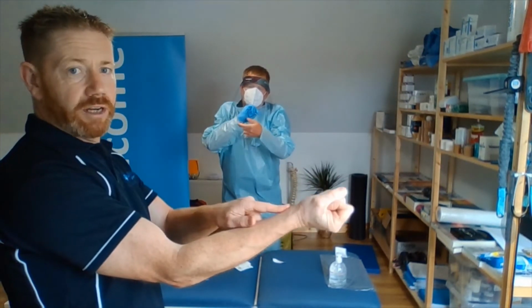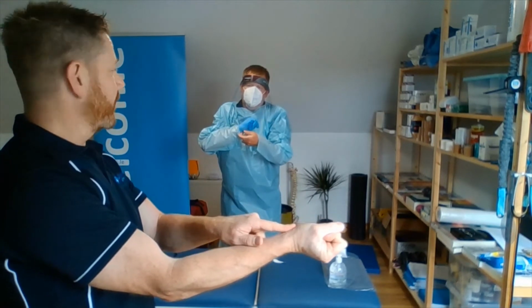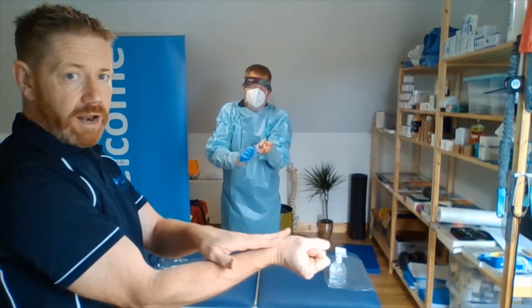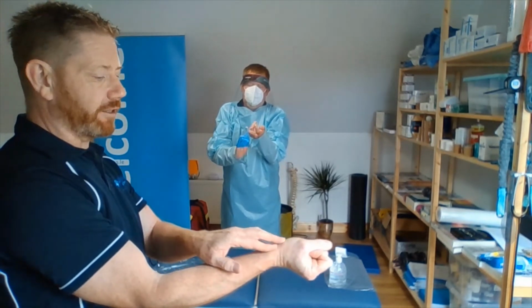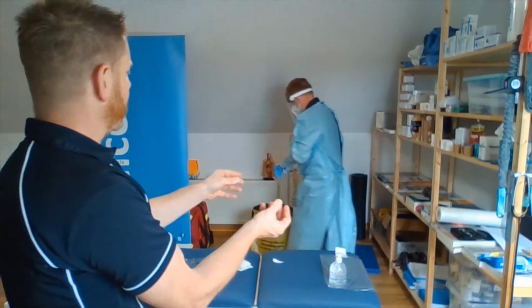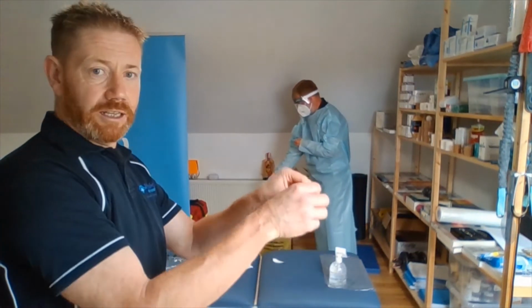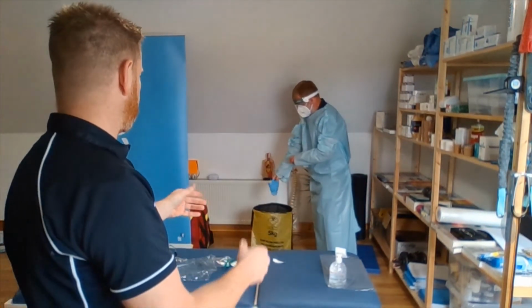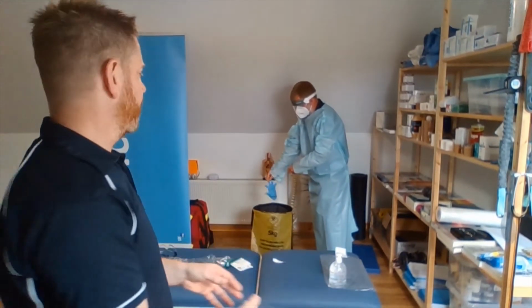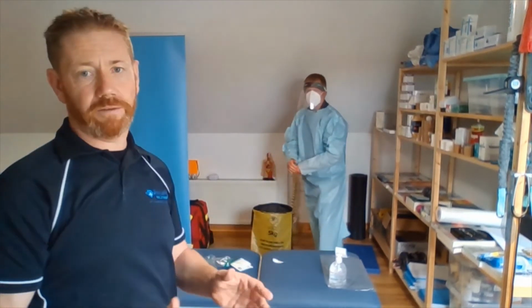With the other hand, he's trying to insert underneath the glove without making contact with the outside of the skin, and then without contacting the outer part of the glove, remove the glove. Now he's going to turn and place that directly into the clinical waste bin that we have right beside the donning and doffing area. So the gloves are off.